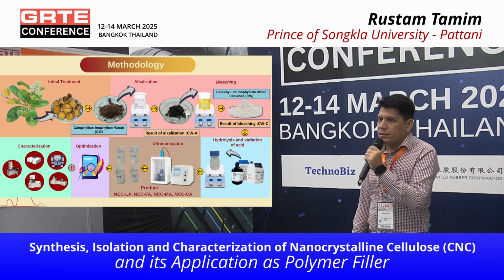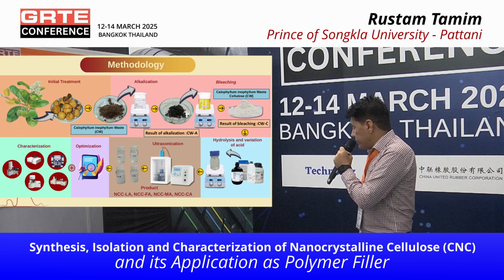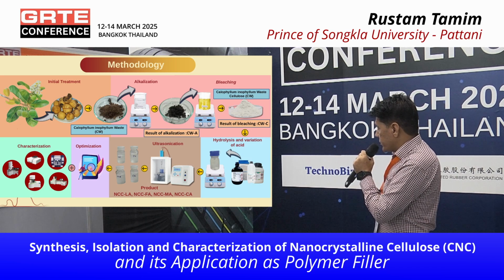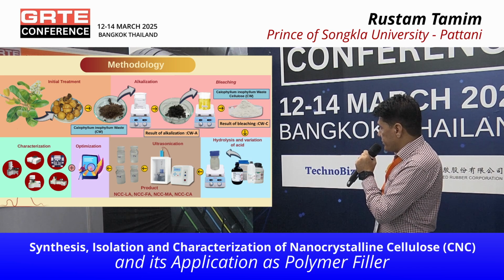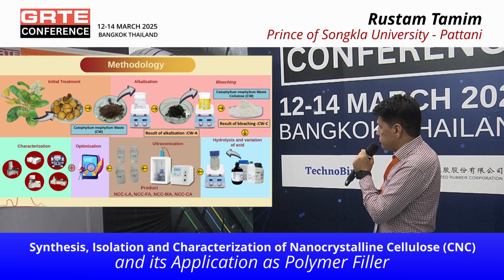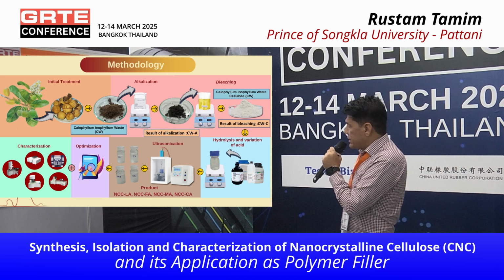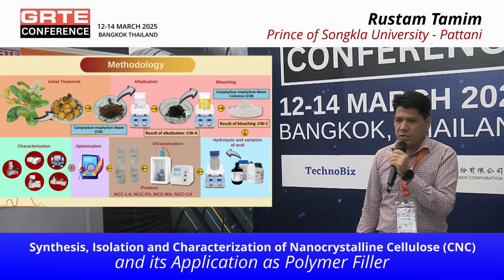Now the methodology: how we synthesize this nanocrystalline cellulose. Here you can see very simply, we took that Calophyllum inophyllum waste, and after the initial treatment, what is the initial treatment?